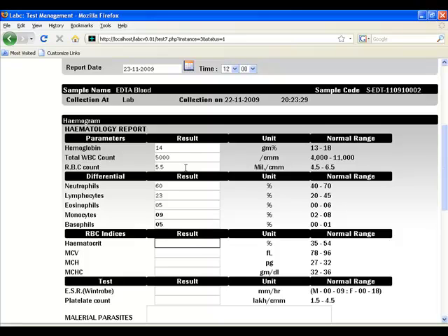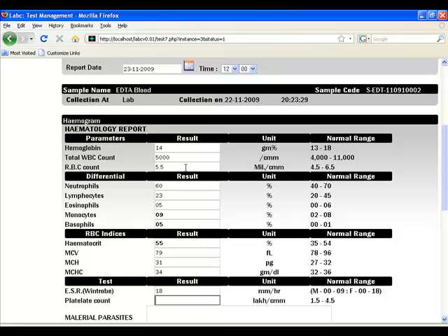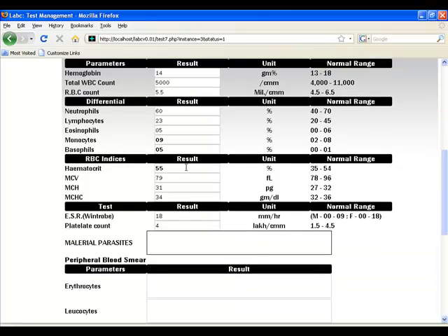Another added feature is that LabC comes with over 200 test templates. These can also be modified and edited by you at the time of installation. You also follow a very simple process for adding new tests.